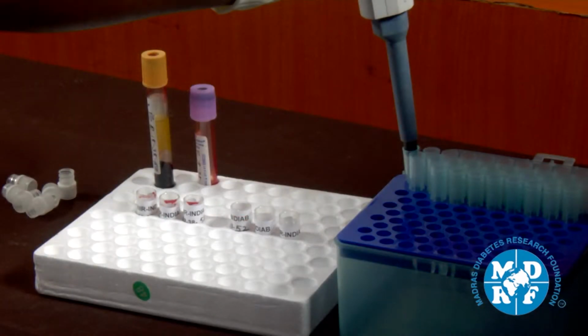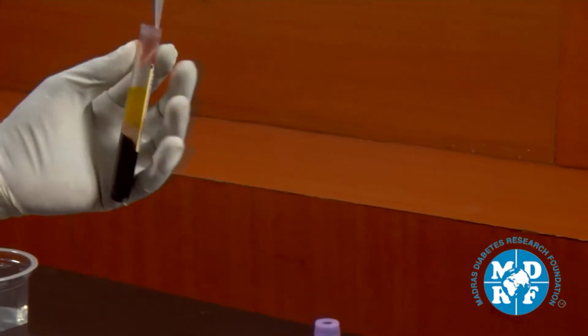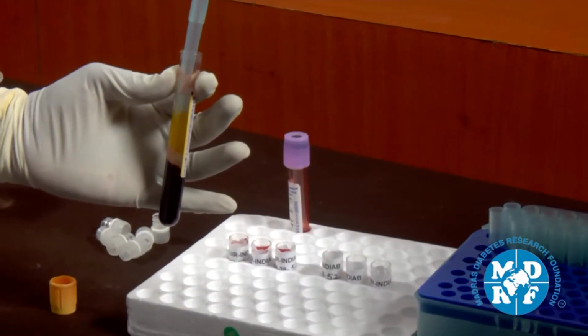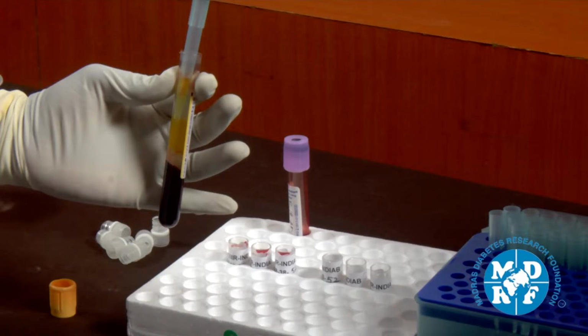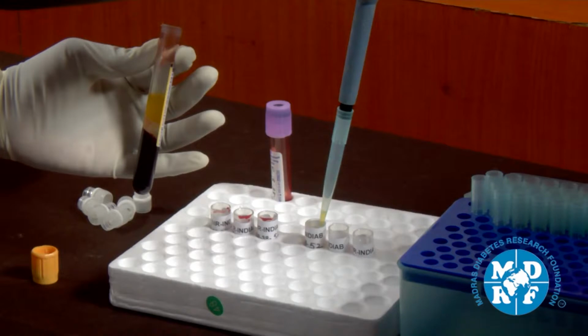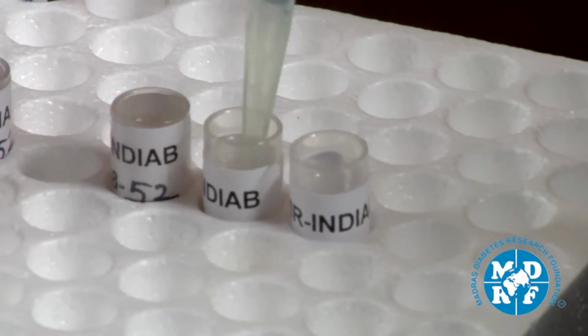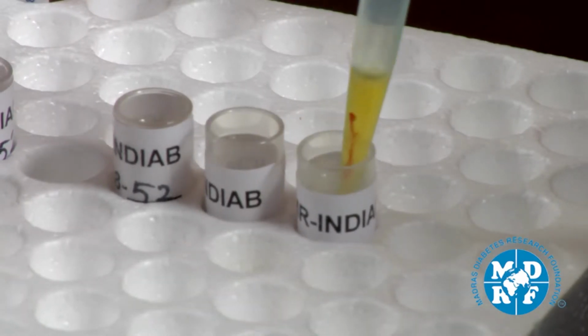To aliquot the samples, first the pipette tip has to be fixed to the micropipette as shown. This is the plunger. Then the plunger of the micropipette is pressed and inserted into the yellow tube containing the serum samples. To draw the sample into the pipette tip, the plunger of the micropipette has to be released gently. Once the sample enters into the tip, it has to be transferred to the 1.2 ml cryo vial by again pressing the micropipette. This process should be followed while transferring samples into all the 3 cryo vials.